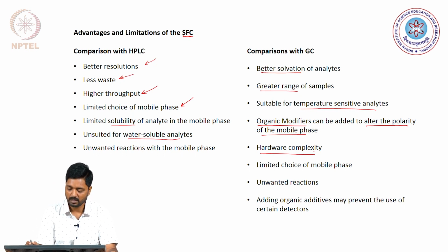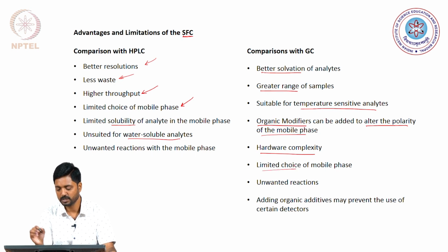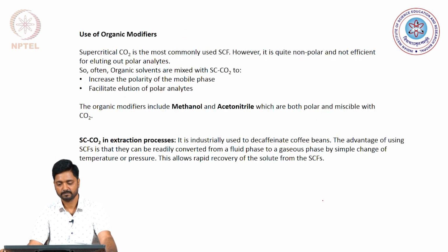Of course, the common challenges here are the limited choice of the mobile phase and the unwanted reactions that have already been discussed, and finally adding of organic additives to alter the polarity of the mobile phase may prevent the use of certain detectors. So, let me delve a little bit on why organic modifiers are added to supercritical fluids.